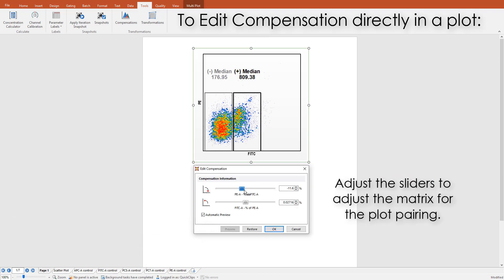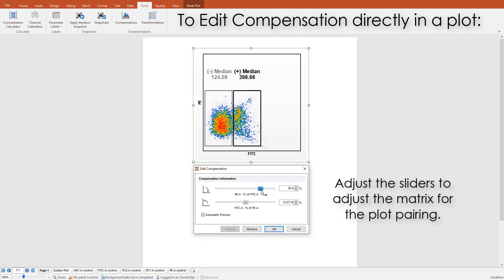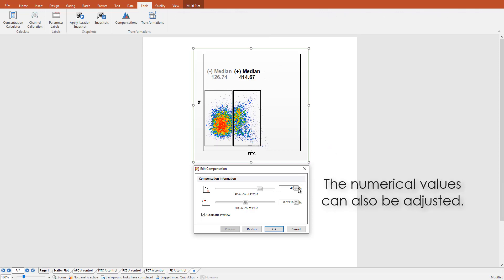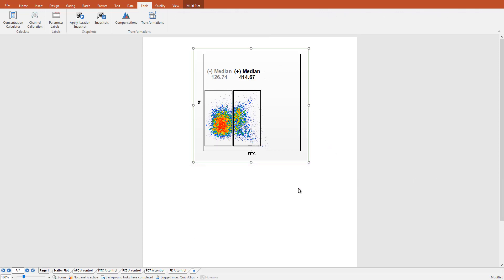Upon making your selection, the slider bars will appear for the two parameters displayed. Make your adjustments by moving sliders or entering values and see the plot update in real-time.